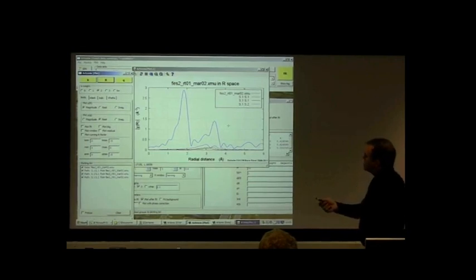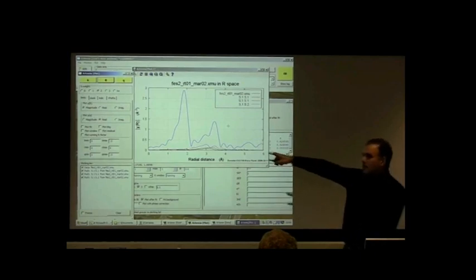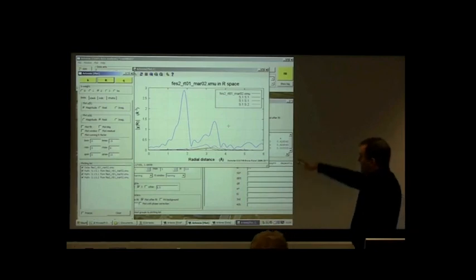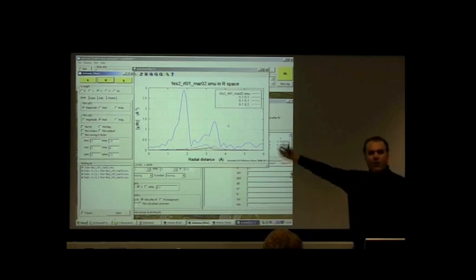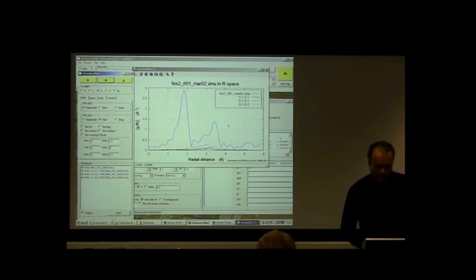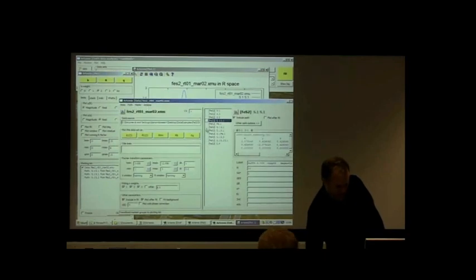But of course, I still haven't applied any value for sigma squared in the fit. So when we actually go to evaluate things, they'll be somewhat smaller than they are right now. But this shows us how those multiple scattering paths relate to the data. Very well. Let's untick those there, untick those there, and tick the next 3. And I'm going to transfer those over.